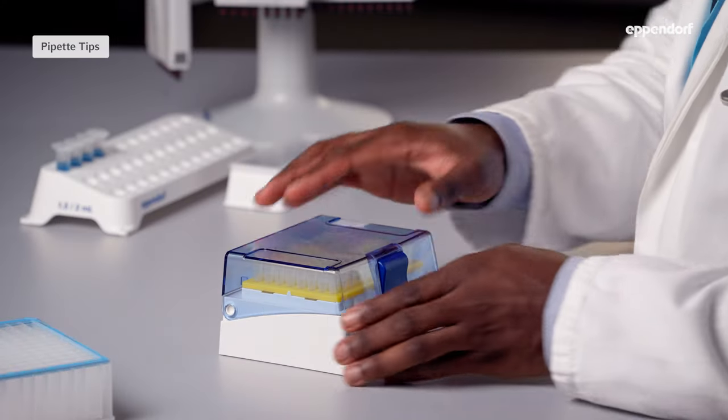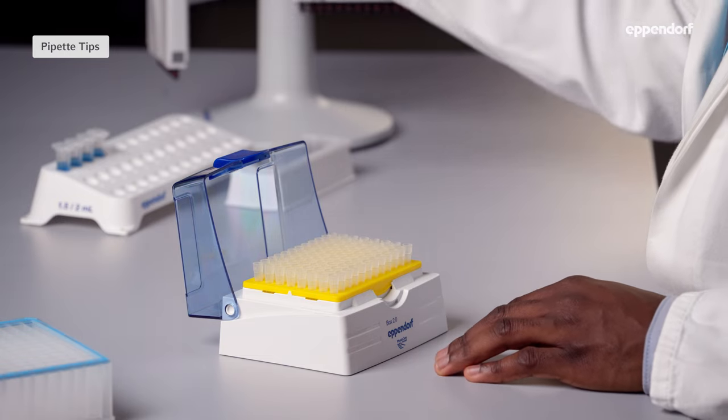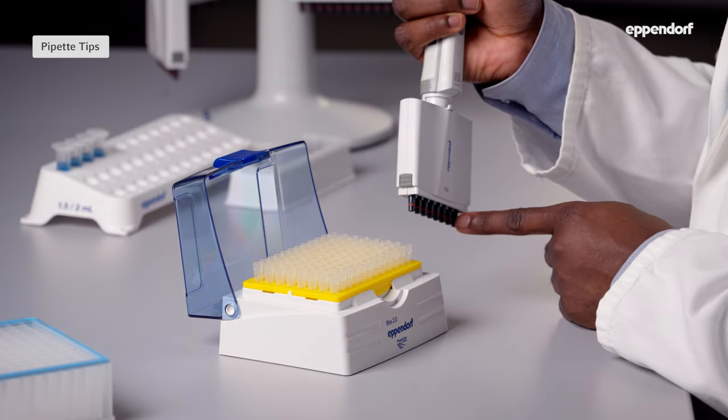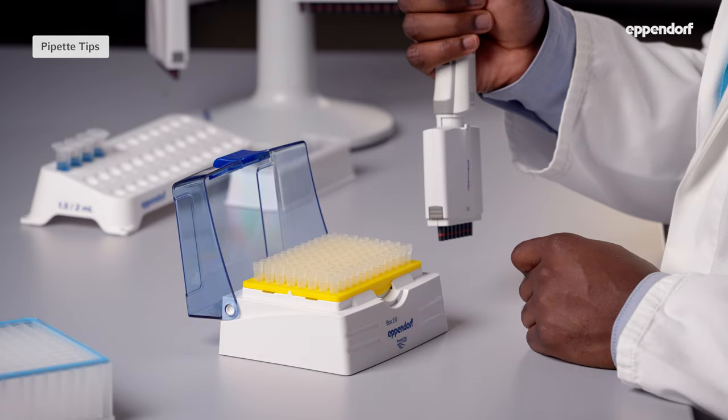Let's talk about pipette tips. Eppendorf pipette tip boxes or racks are color-coded so you can easily find the right tips for your pipette. Here we have a yellow 100 microliter pipette and a yellow tip box. When the tips match the volume of your pipette correctly, the number of channels on your pipette will be the same as the number of tips in either the horizontal rows or the vertical columns in the box.